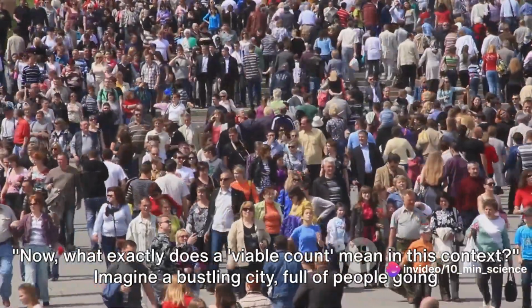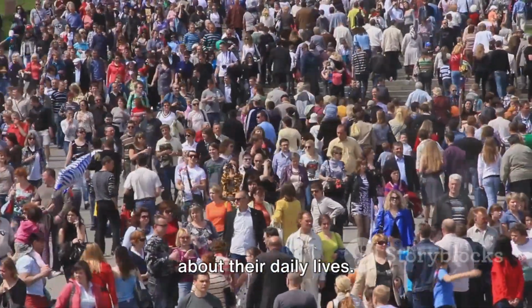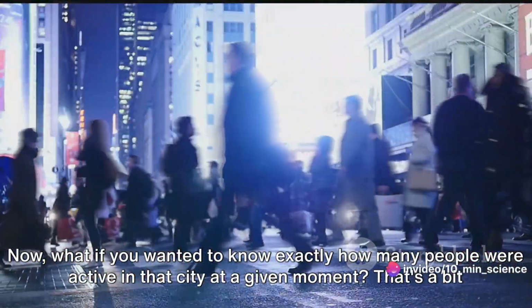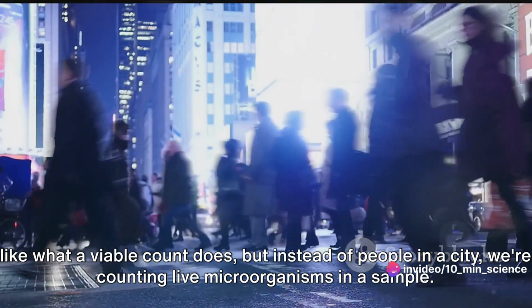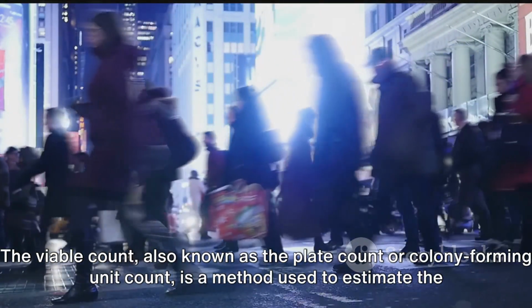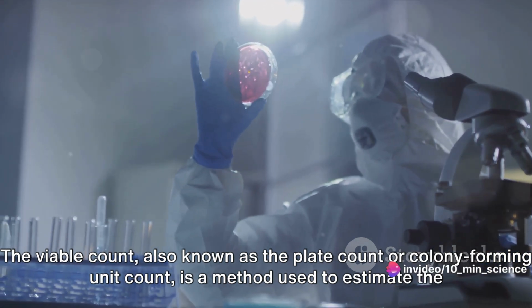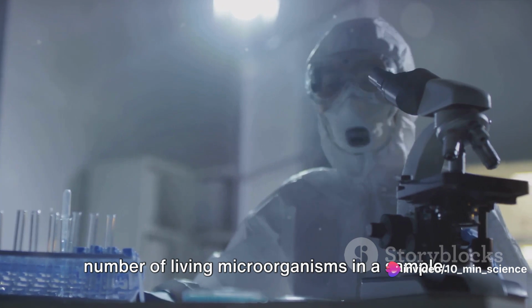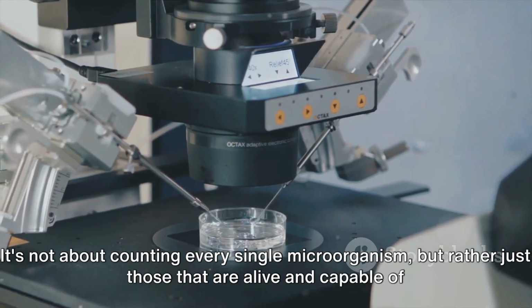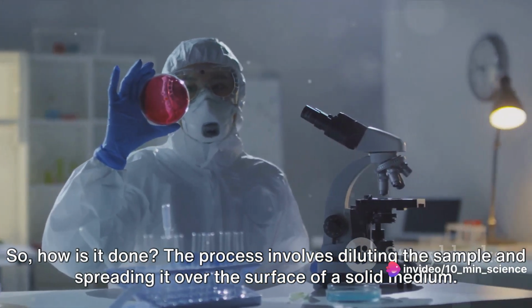Now, what exactly does a viable count mean in this context? Imagine a bustling city, full of people going about their daily lives. Now, what if you wanted to know exactly how many people were active in that city at a given moment? That's a bit like what a viable count does, but instead of people in a city, we're counting live microorganisms in a sample. The viable count, also known as the plate count or colony-forming unit count, is a method used to estimate the number of living microorganisms in a sample. It's not about counting every single microorganism, but rather just those that are alive and capable of multiplying under favorable conditions. So, how is it done?